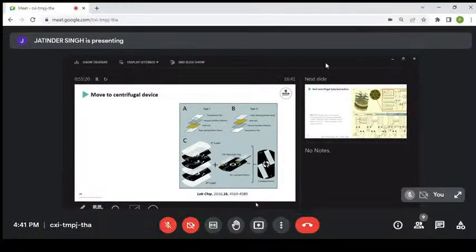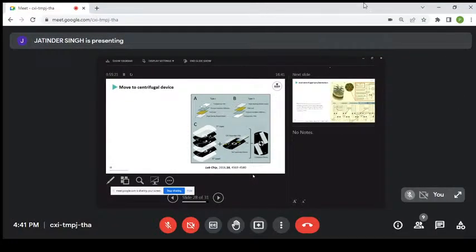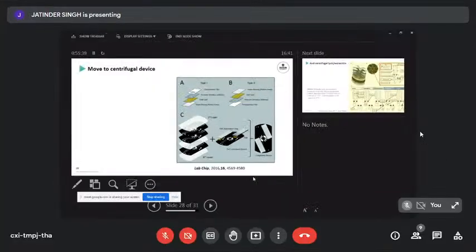So they then moved to a centrifugal device, where here we've got a system to do the electrophoresis. This is a commercial system, so the whole system is not out in the literature. There are two different bits there. Here we've got a centrifugal system where, again, we've got our separation chip with the separation channel for the CE. They use some gold leaf that you'd use to put on wishing cards for people.